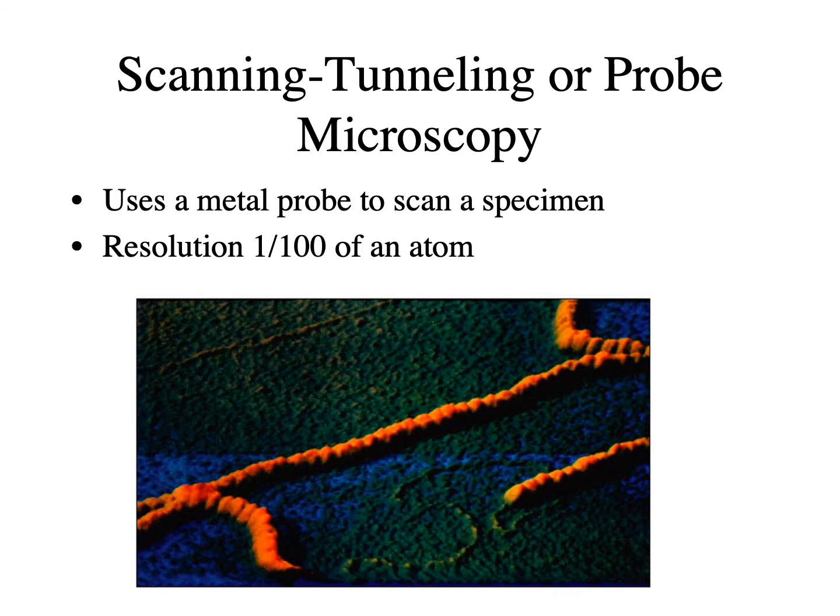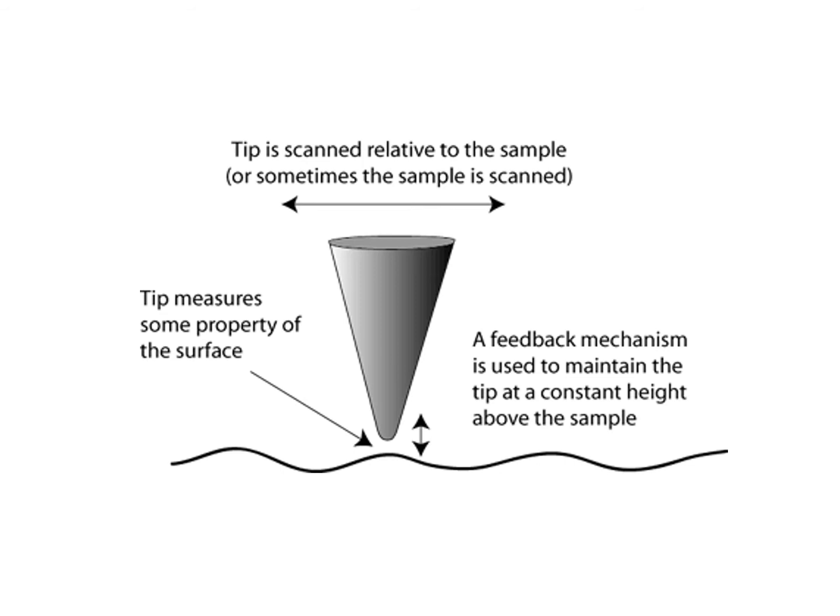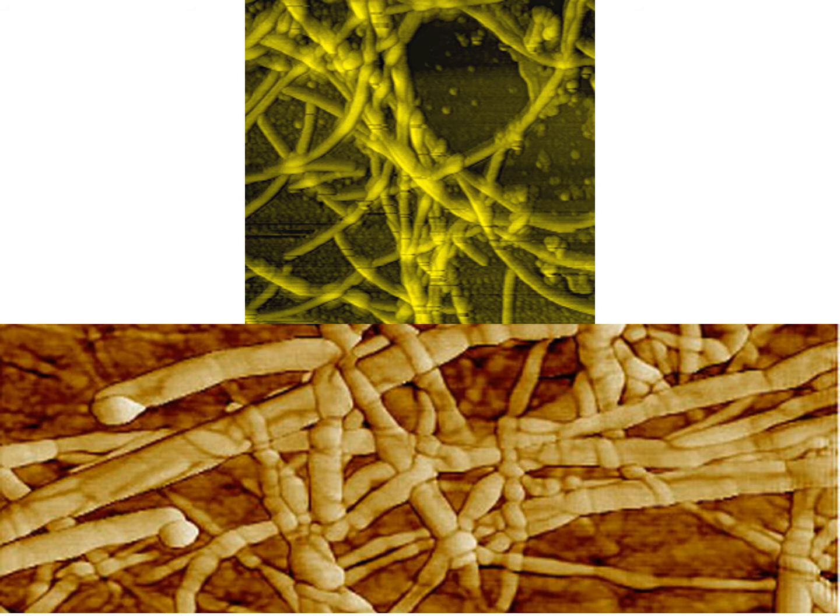But this is not actually approved for clinical use yet. It is still sort of research stuff, but it's cool. So here's just a close-up of the tip. It's going to drag over the surface of the specimen. And you'll see two generations of a scanning probe image. These are both masses of flagella, basically. And you can see it kind of looks digitized, like it looks like a computer did it. But this is incredible in the detail and the smallness of things that we can actually see.